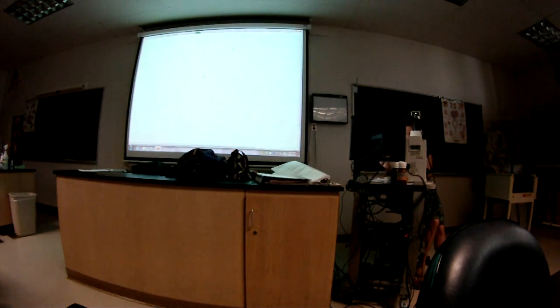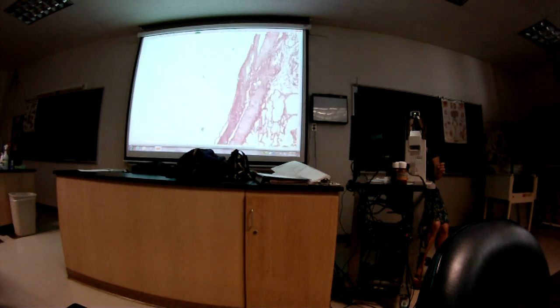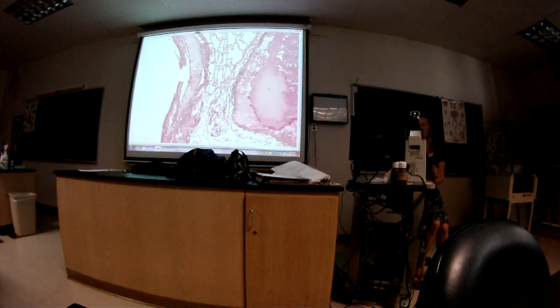Okay, so let's move on. Question 11 was, what kind of tissue is that? And you just did it. What is it again? Hyaline cartilage. Hyaline cartilage. Good. And then question 12.